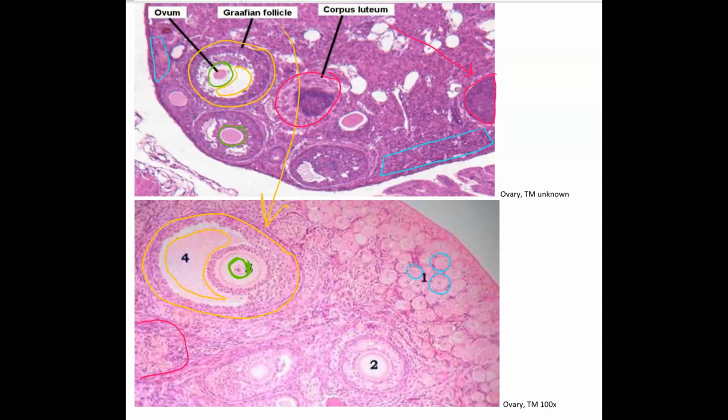And part of its importance is that it will secrete some estrogen, but maybe somewhat more importantly, it will continue to secrete progesterone from day 14 or the day after ovulation till just about the end of the uterine cycle, to maintain and keep building up the uterine lining, the endometrium, just in case there's a fertilized ovum that needs a place to implant. And eventually it will turn into the corpus albicans and then shrink a little bit more.